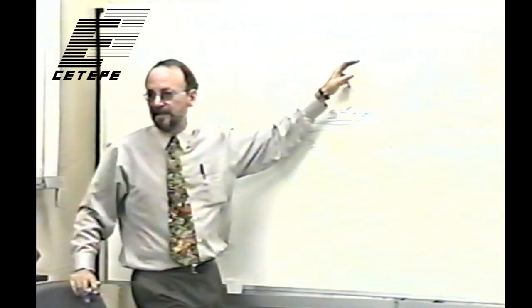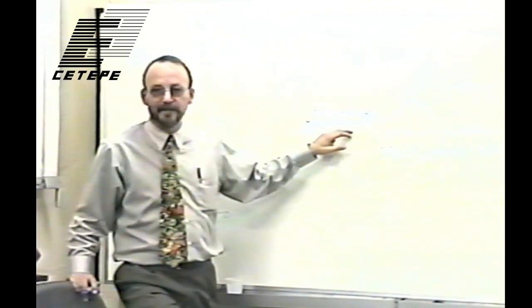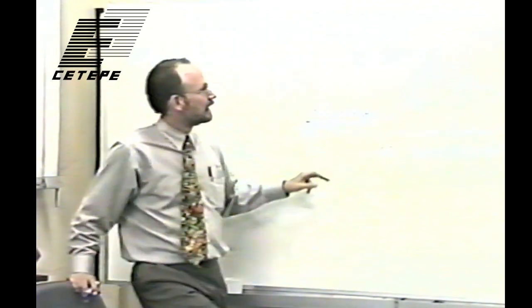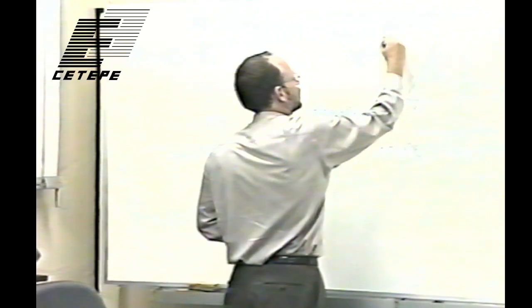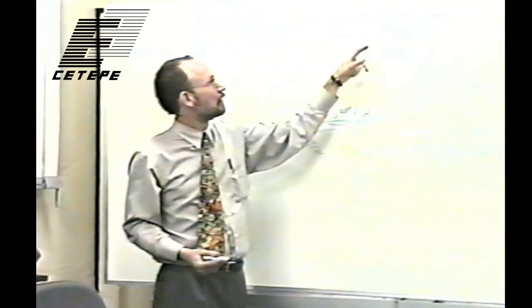Just to give you an idea, dynamic range is basically the maximum signal you can measure over the minimum signal you can measure. So you can't measure any signals below here, so the minimum signal you can measure in film is fairly big compared to zero. And so you have max over min. So if your min is not close to zero, that's going to make this number small.